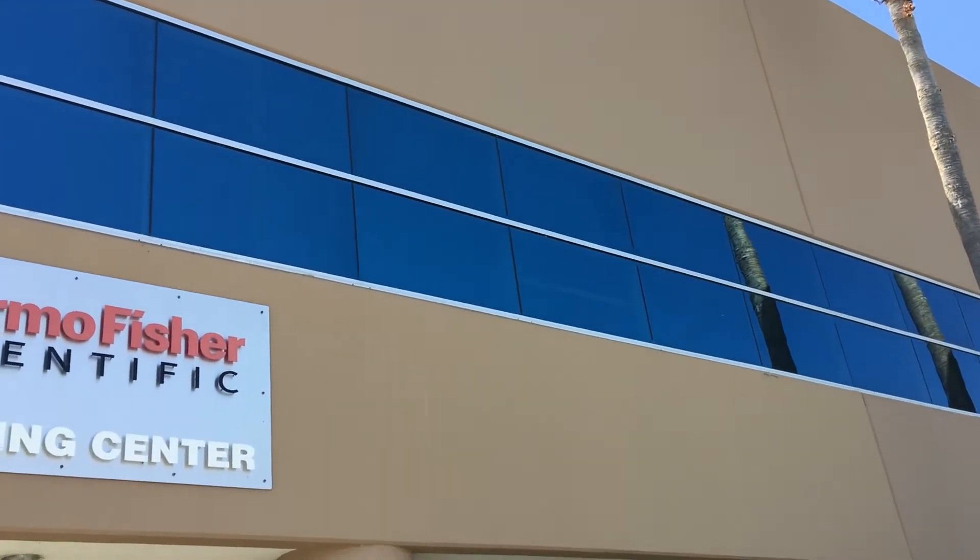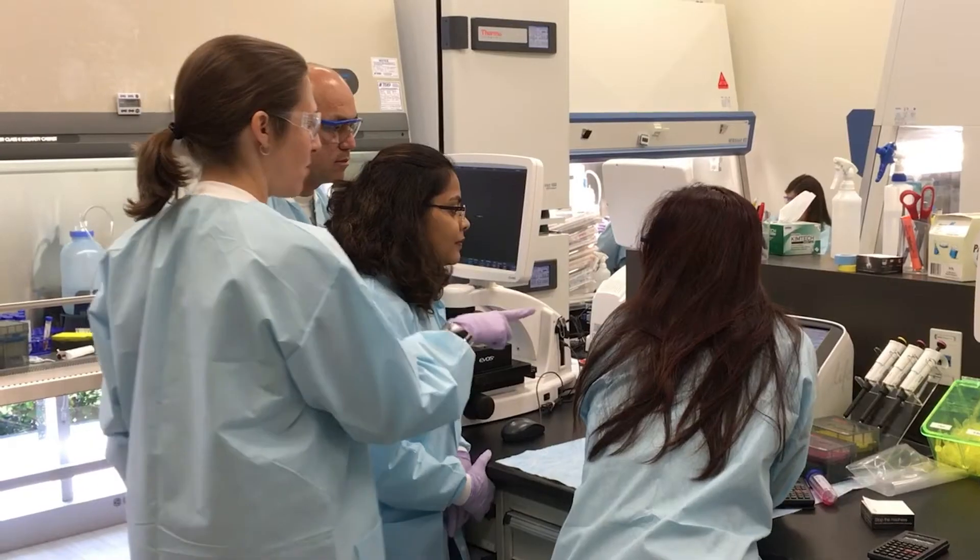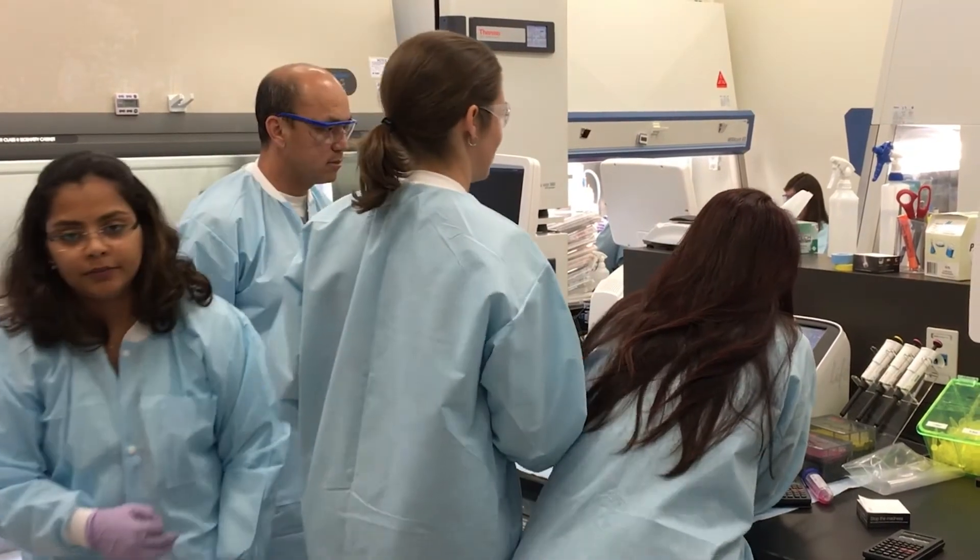The CRISPR hands-on workshop is a course that we've developed here at Thermo Fisher Scientific where our customers can come in, learn the basics of CRISPR Cas9 based editing, and take those techniques back to their labs and have success.